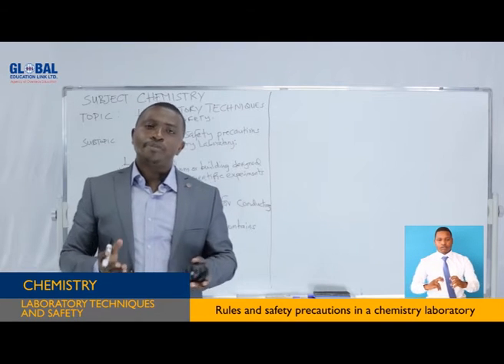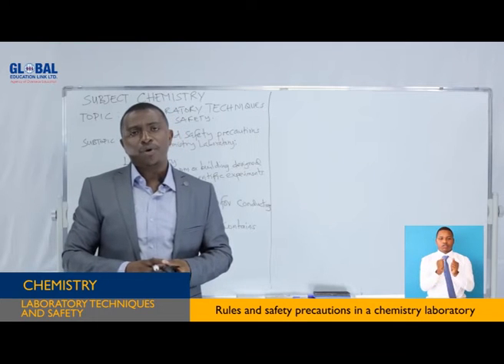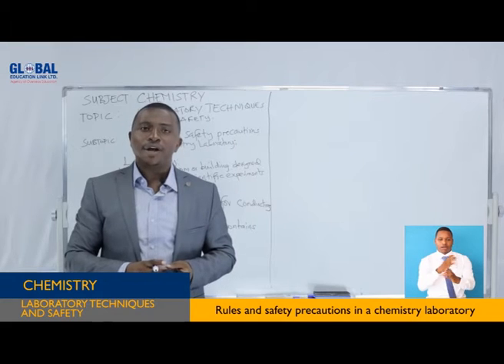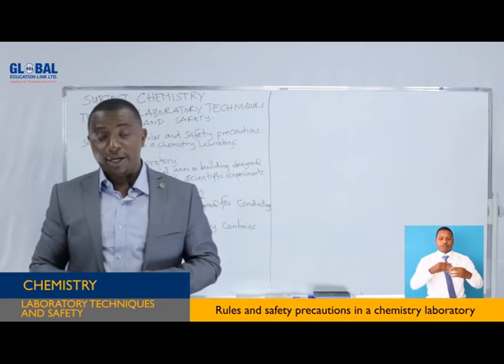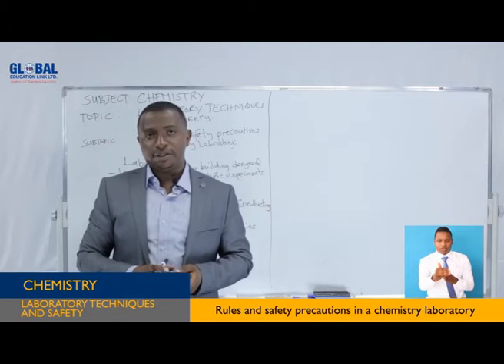Because of the presence of these chemicals and tools, one has to be careful when entering the laboratory, careful when performing experiments, and also careful after conducting an experiment.